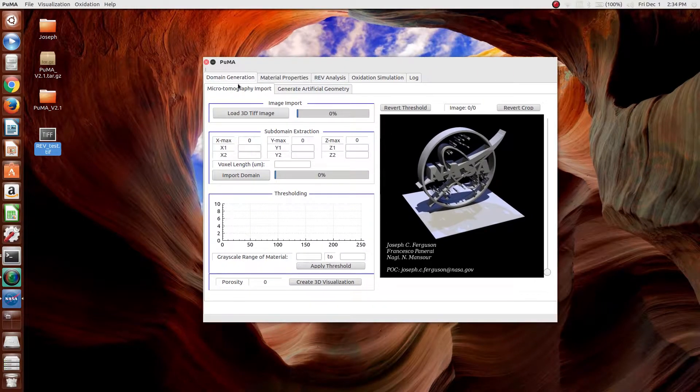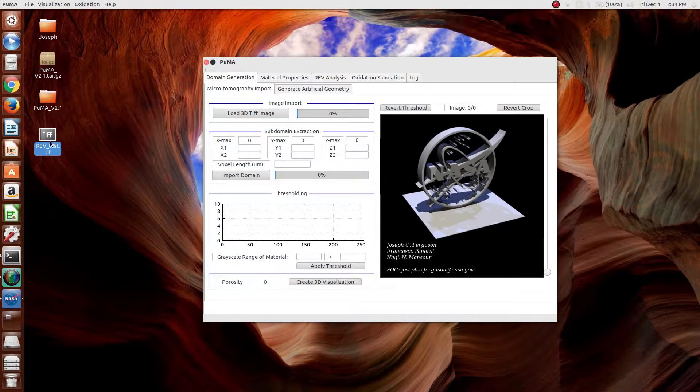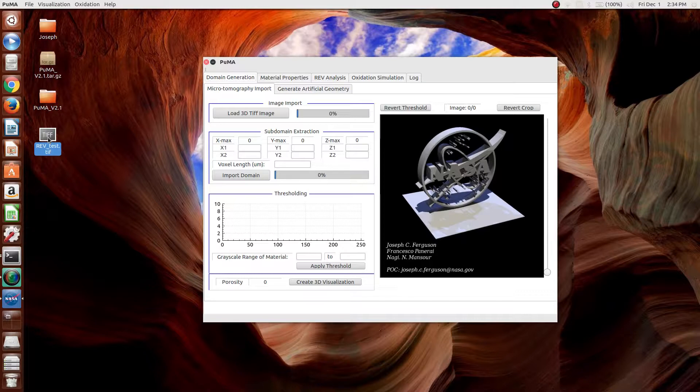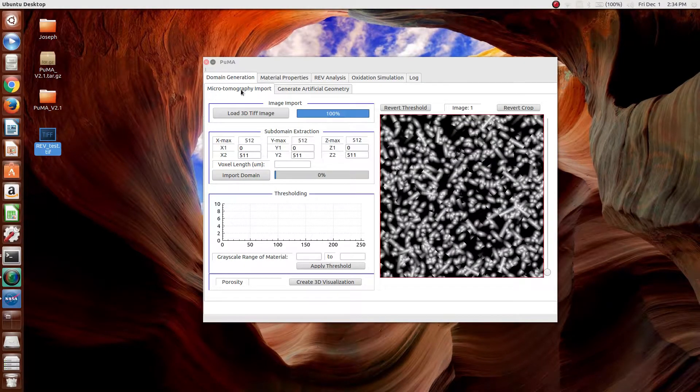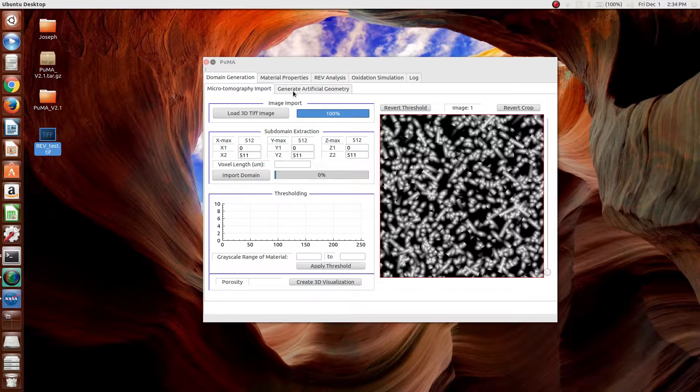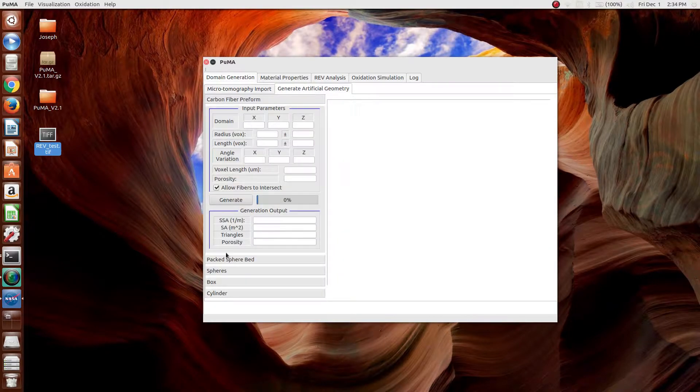Now, to perform representative elementary volume analysis, we need a domain to analyze. This domain needs to be imported through the microtomography import option, not generated as an artificial geometry.